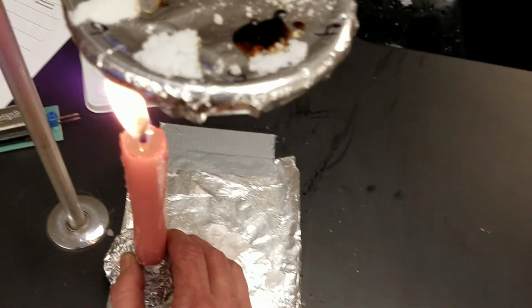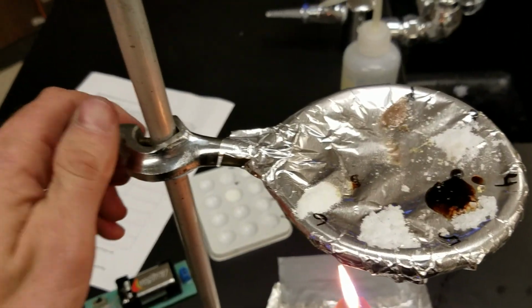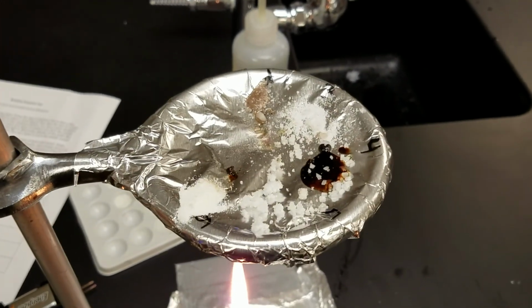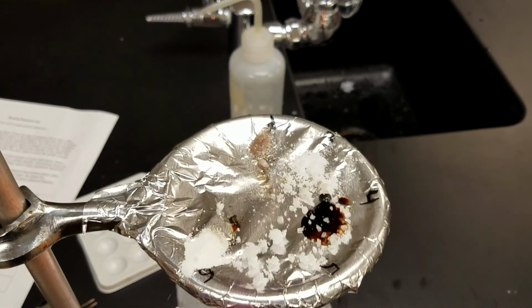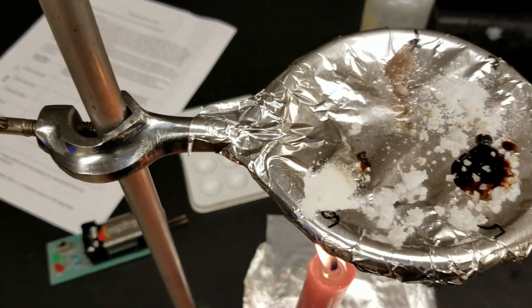It does seem to be doing something. It looks like it's turning brown. Let's try moving this a little bit closer to the flame. So this flame is right underneath it.